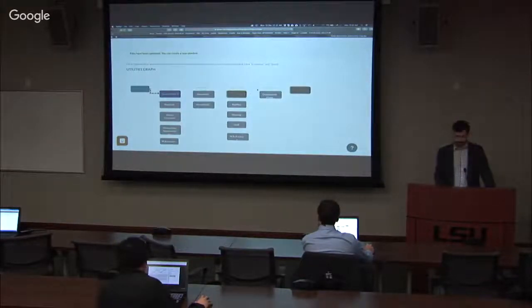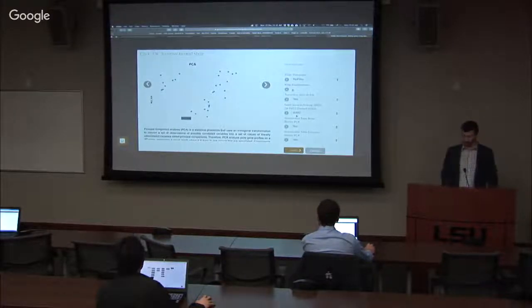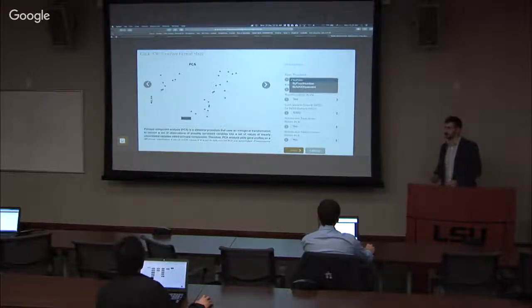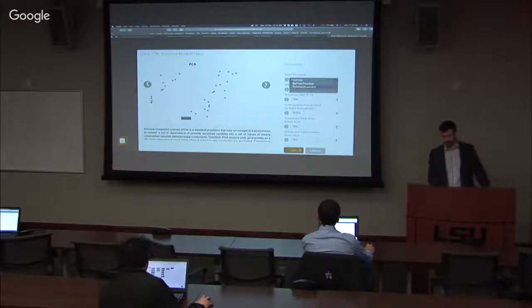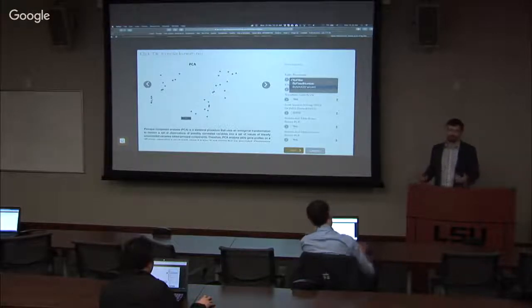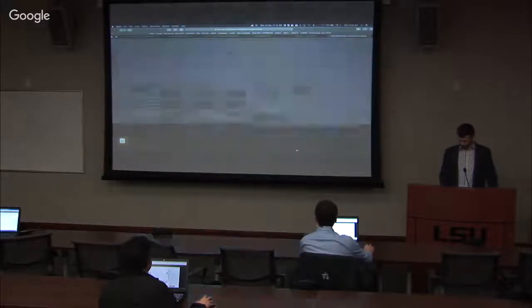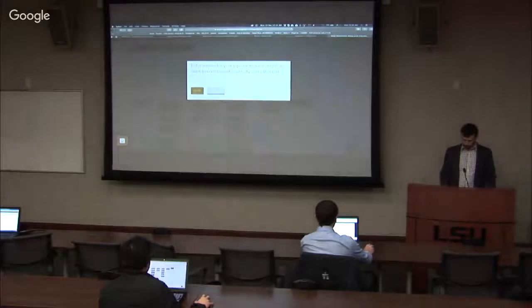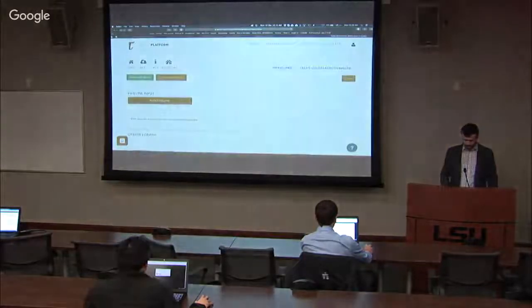And you can also do PCA, but in our case, let's go ahead and just do that. You also have some filtering abilities right here. So if you want to go ahead and set up a filter, you have two options. You can do a fixed number, like filter everything below a certain threshold, which we already did in quantile normalization. Or you can just take only the 25%, right? What is interesting a lot of times when you do PCA is you want to focus on the variability that is most representative of the differences between the samples that you have. So you can also do that. In our case, we don't have to do that. Let's just go ahead and save it and run it.